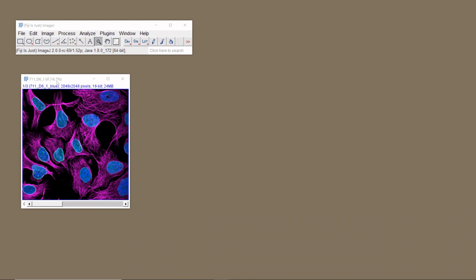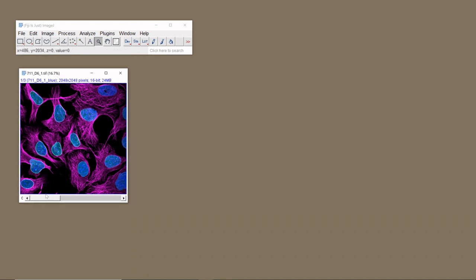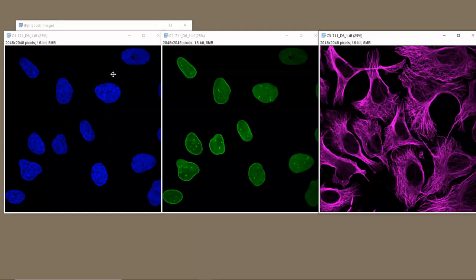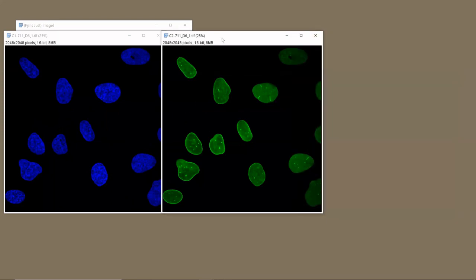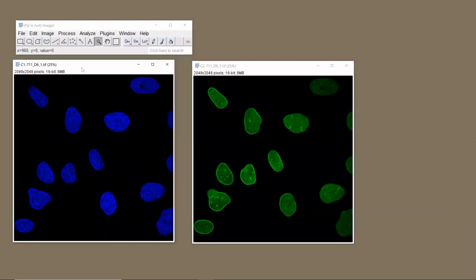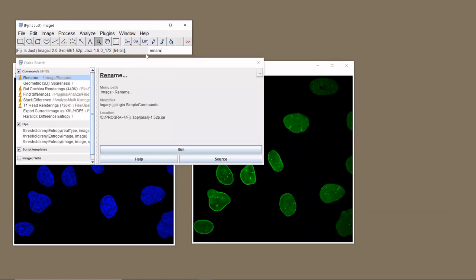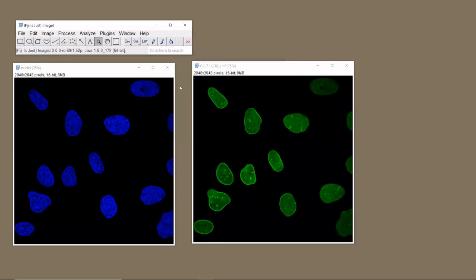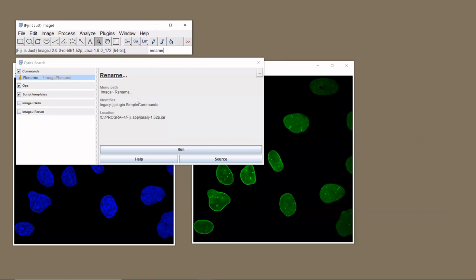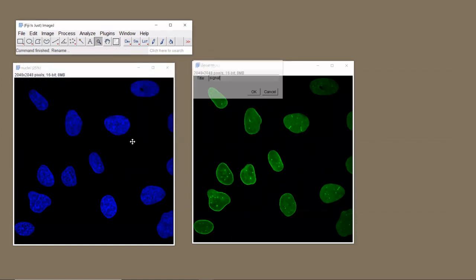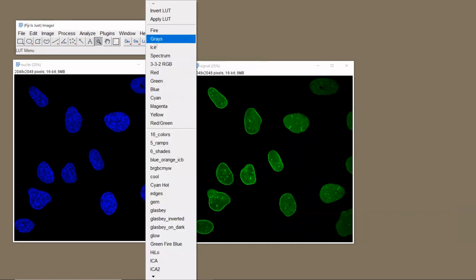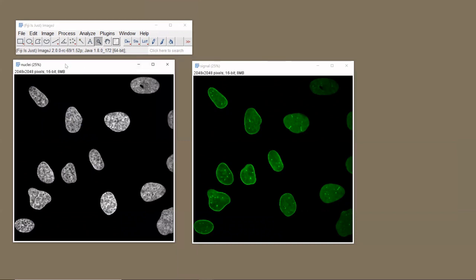Let's have a look at the workflow together. Here is my image — it's a three-channel stack: the first channel is the nuclei, the second is the signal, and the third is the microtubules. The first thing I do is split this stack into three individual images by running Split Channels. I close the microtubule image, then rename channel one to 'nuclei' and channel two to 'signal'.